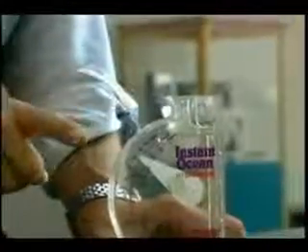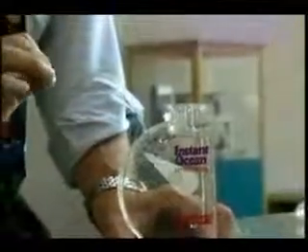You'll notice that the arm will go up and down depending on what types of chemicals or how many chemicals are actually dissolved in this water. By using a hydrometer, we can help to tell the density of liquids.